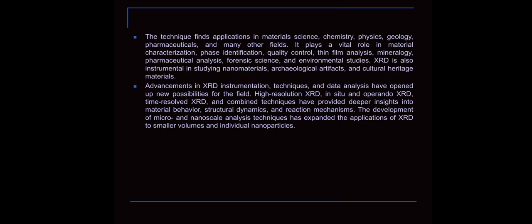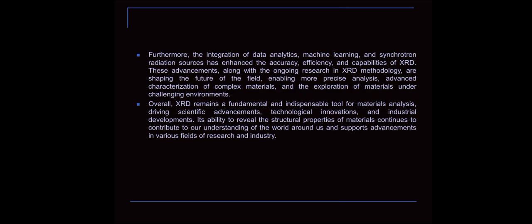Advancement in XRD instruments, techniques, and data analysis have opened new possibilities for the field. High resolution XRD, in situ and operando XRD, time resolved XRD, and combined techniques have provided deeper insight into material behavior, structural dynamics, and reaction mechanisms. Furthermore, the integration of data analytics, machine learning, and radiation sources enhance the accuracy, efficiency, and capabilities of XRD. These advancements, along with the ongoing research in XRD methodology.